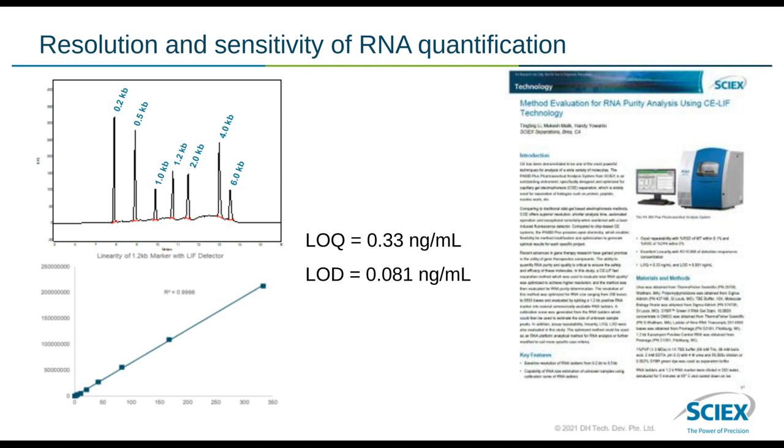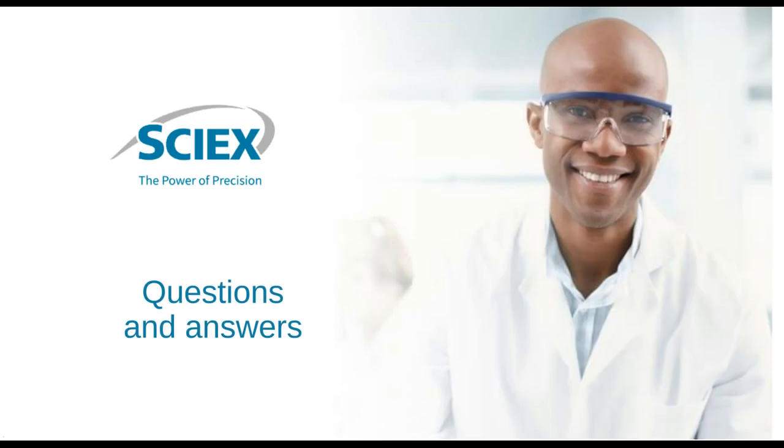We do have a question related to how you optimized the sample injection. Well, there's a few ways. At first I started with our normal injection parameters, which would be about 1,000 volts for 2 to 4 seconds. And looking at the publication that I referenced from MedImmune, they went all the way up to 8,000 volts for about 20 seconds. So that's going to be the high end.